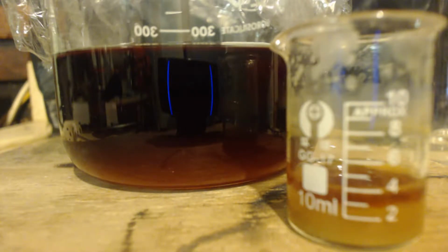And then I filtered it again, and I barely got anything. I got maybe a quarter gram for the 55 hours extra that I did, so it was not worth it. Now we're going to go into the next clip where I'm filtering everything out, both from the 7.5 hours and the piddly quarter gram from the 55 hours, combined together, and that's where the video will start.